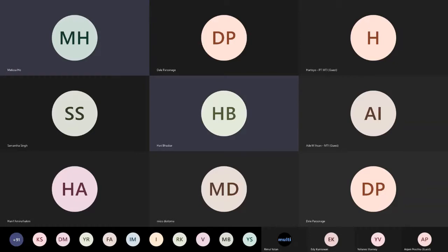Okay, that's a really good tip, Hari. I think the audience definitely appreciates that. And just a last question, how do I detect carbon in high carbon ferrochrome using the Epsilon 4?